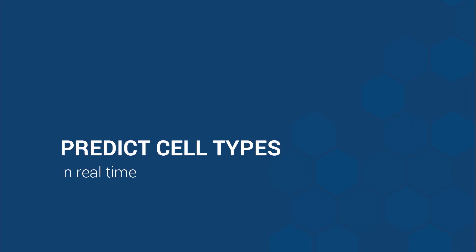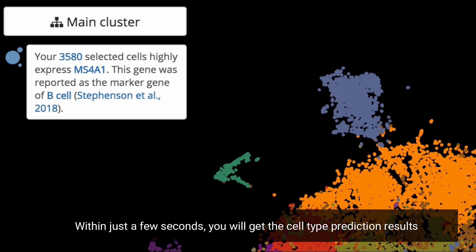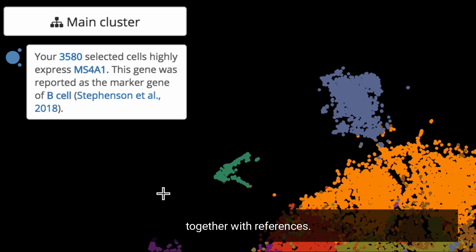Predict cell types in real time. Whenever you select a population, within just a few seconds, you will get the cell type prediction results together with references.